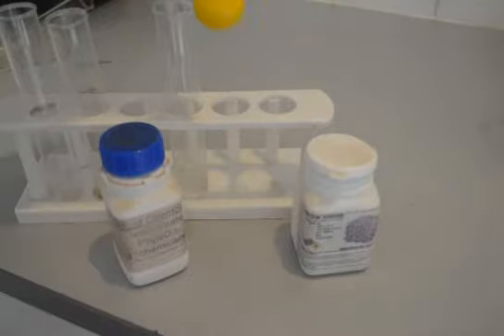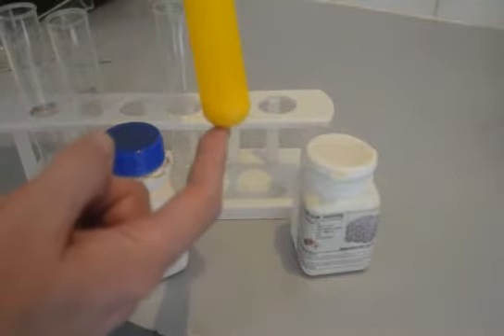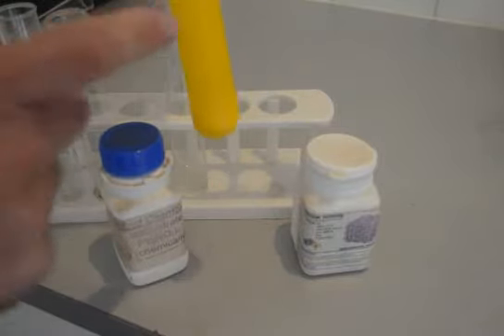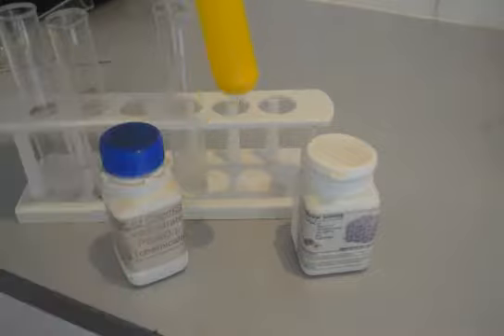And you can start to see it settled now, so you can start to see the actual compound lead iodide at the bottom. So we'll leave that for a few minutes and come back, and all this should be clear water and just the precipitates left at the bottom.